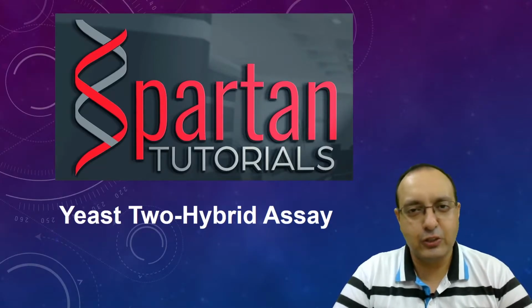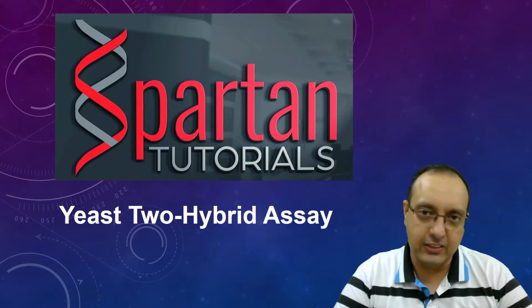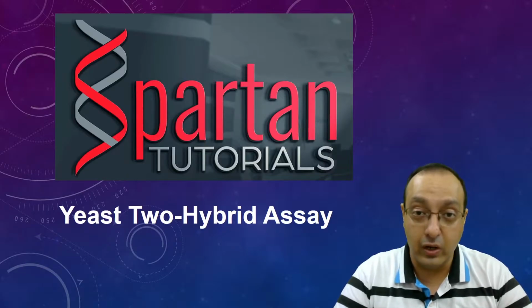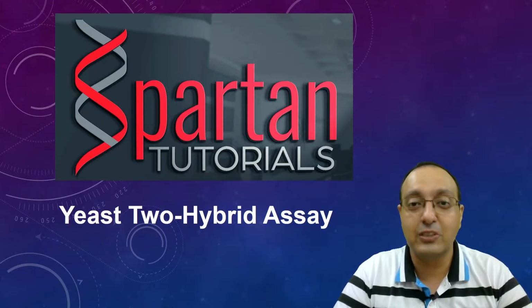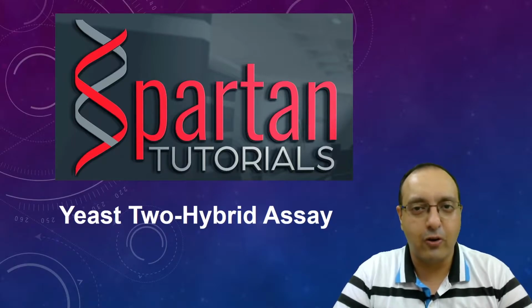Today I shall discuss with you a very important biochemical technique that has revolutionized our understanding of biology over the last 30 years. Even after 30 years have passed, this is one of those techniques that is still commonly used in research labs around the world. So it has a lot of longevity. Not many techniques can boast of this accomplishment, that they are still used even 30 years after their development. And that technique is called Yeast Two-Hybrid Assay. So let's dive into what it is all about.